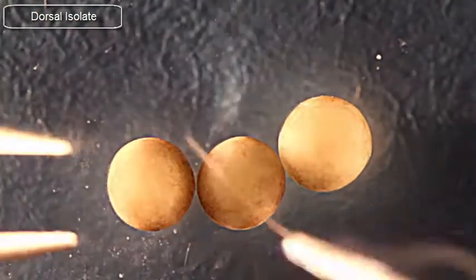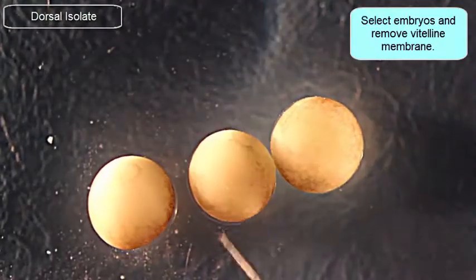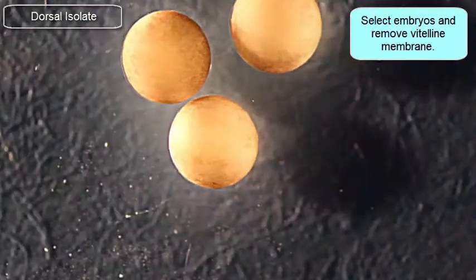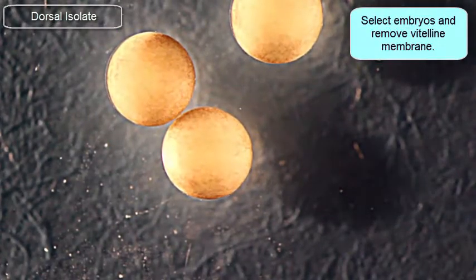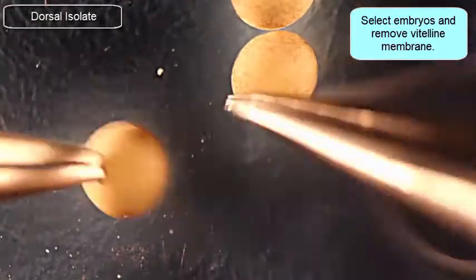In this video, I'm going to dissect the dorsal isolate from a stage 12 and a half embryo. I'm going to first go through and select embryos that are of the right stage, and then remove their vitelline membrane. I'm looking for embryos that are consistently stage 12 and a half or so.